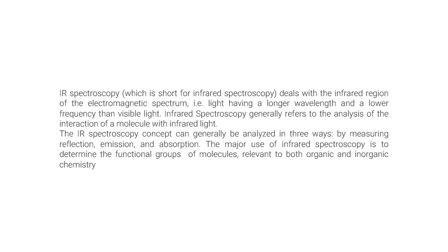The major use of infrared spectroscopy is to determine functional groups of molecules, relevant to both organic and inorganic chemistry. Here, I want to mention, whenever you want to characterize materials, either prepared in the lab or found somewhere, for chemical properties this is one of the strongest ways to check.